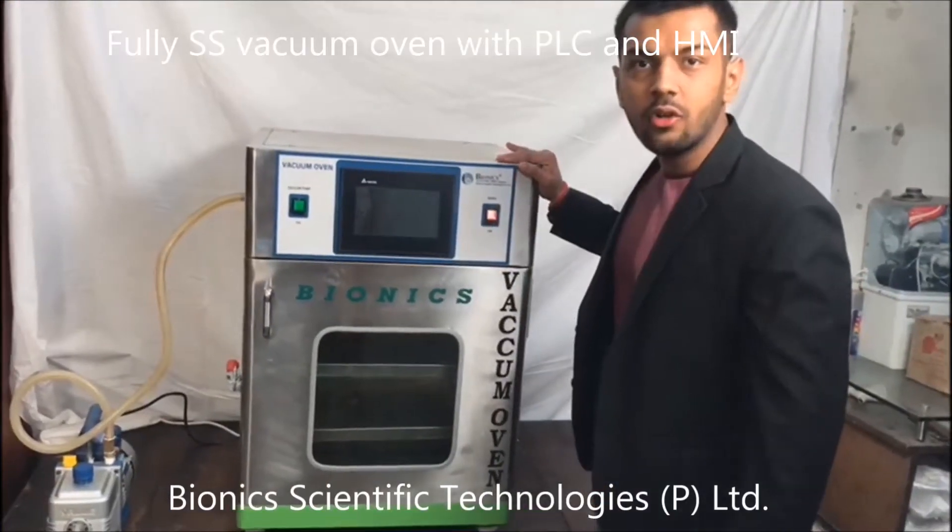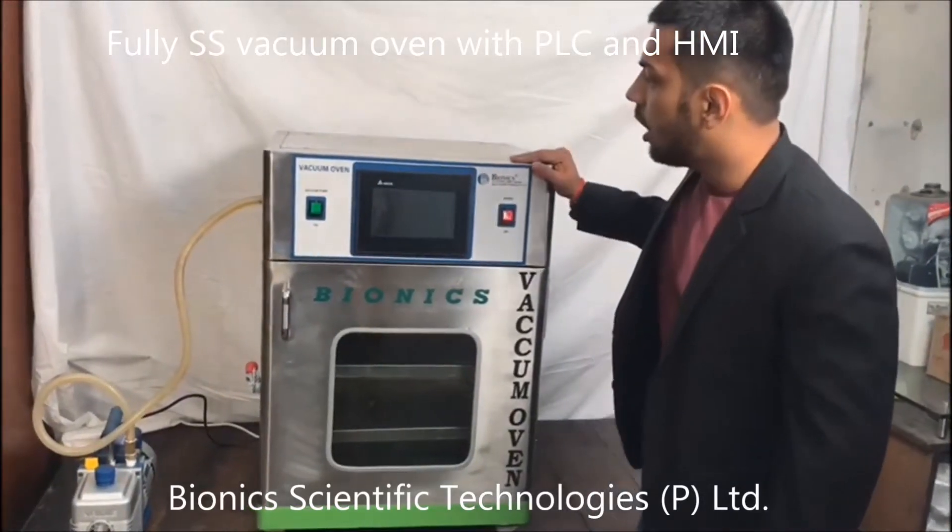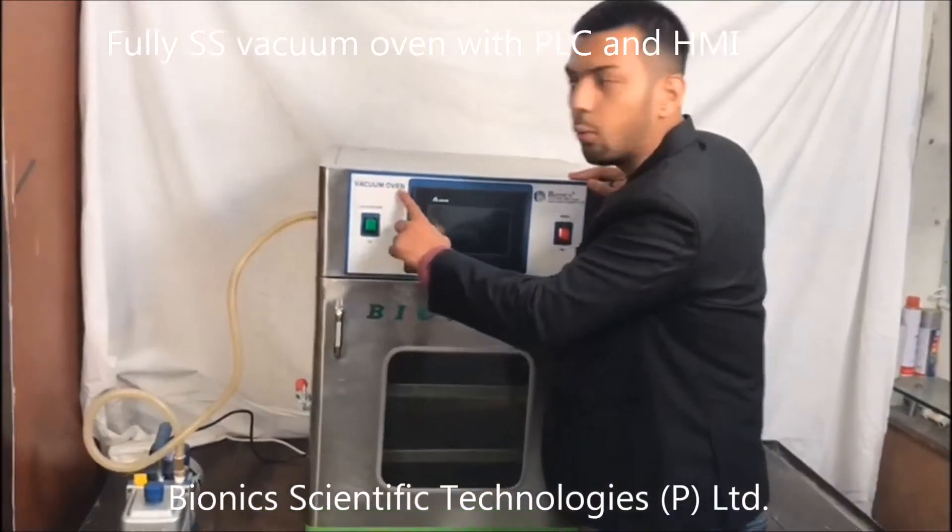Welcome to Bionic Scientific Technologies Pvt Ltd. Today we are introducing our product: the vacuum oven.